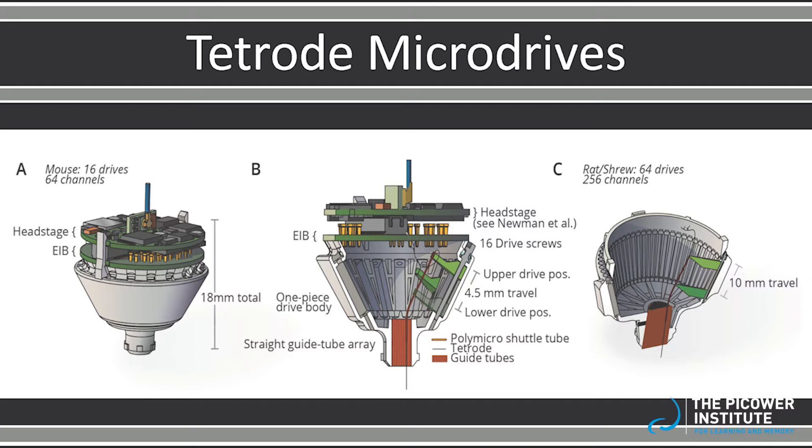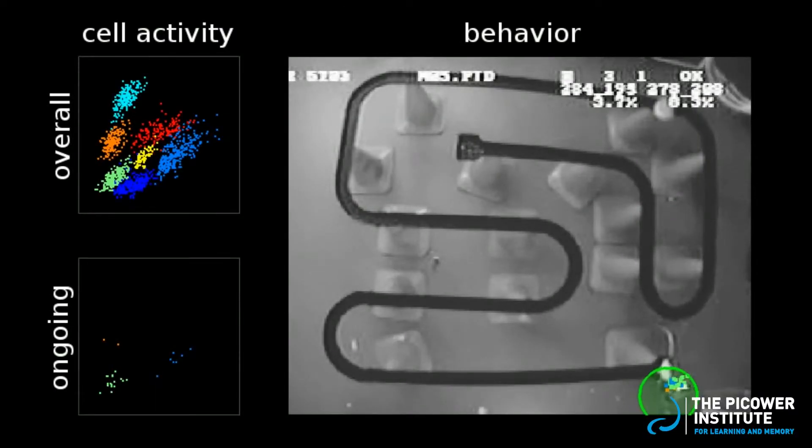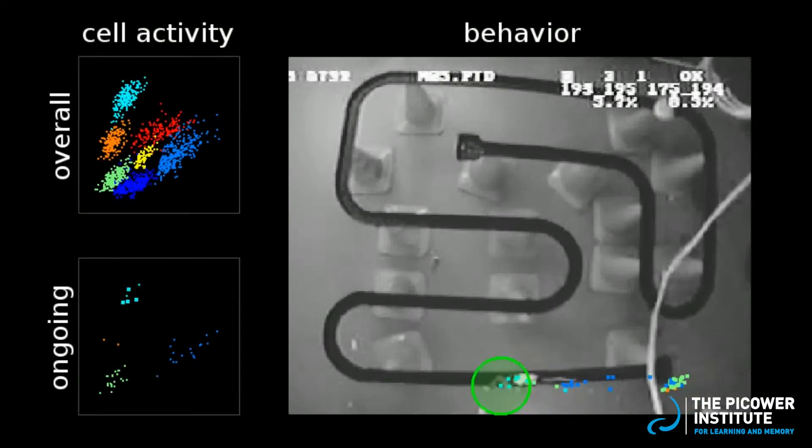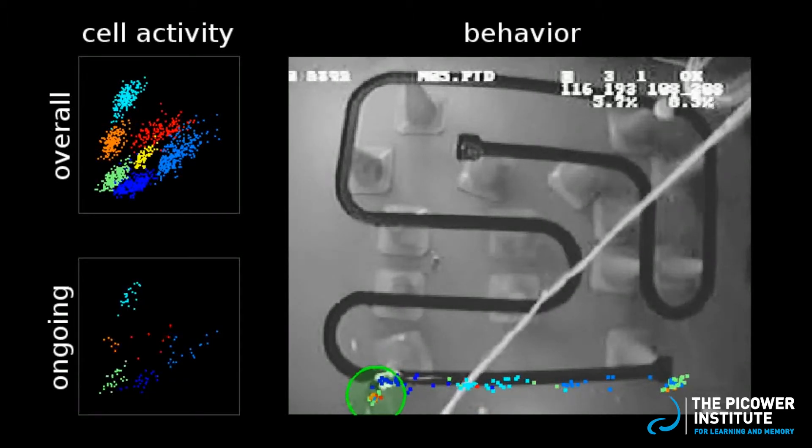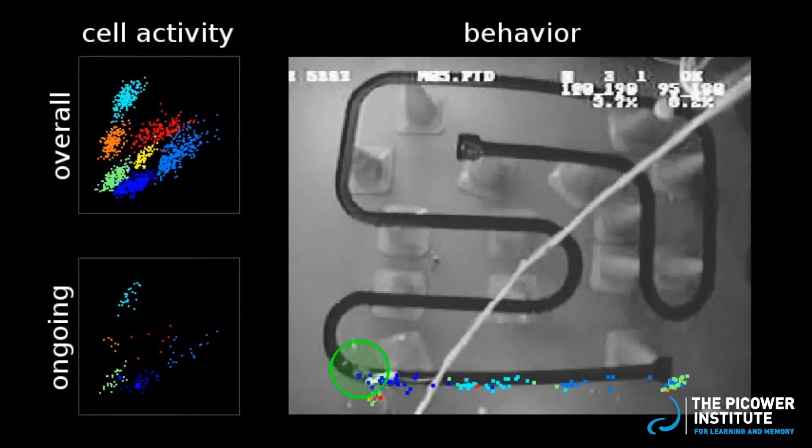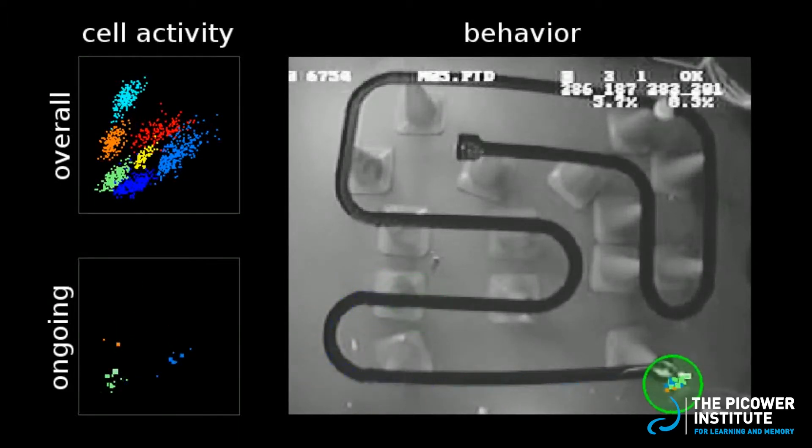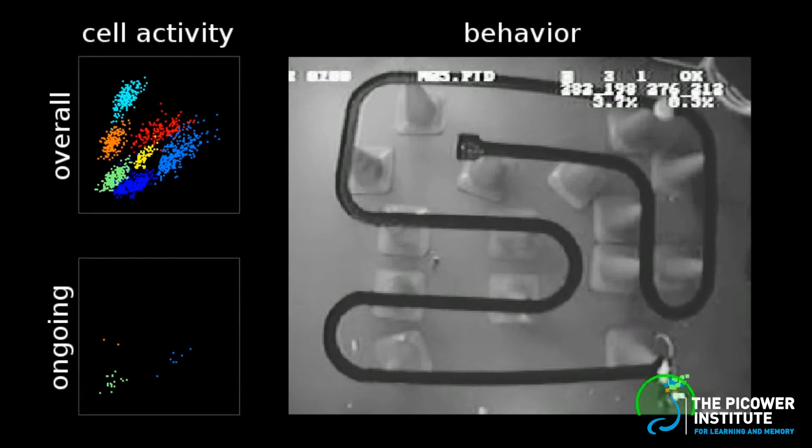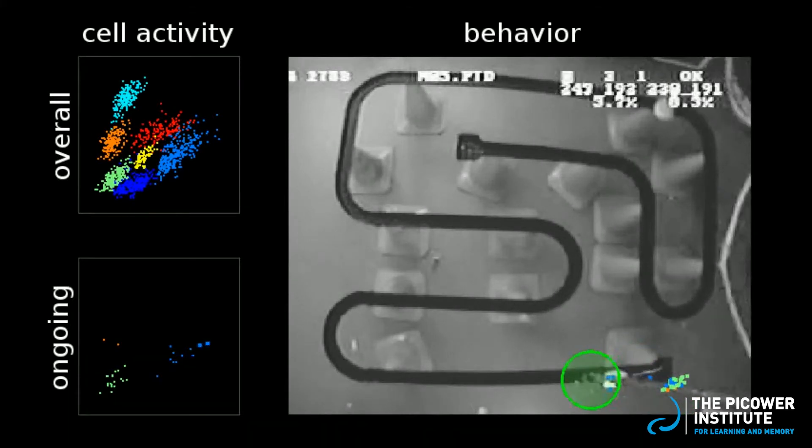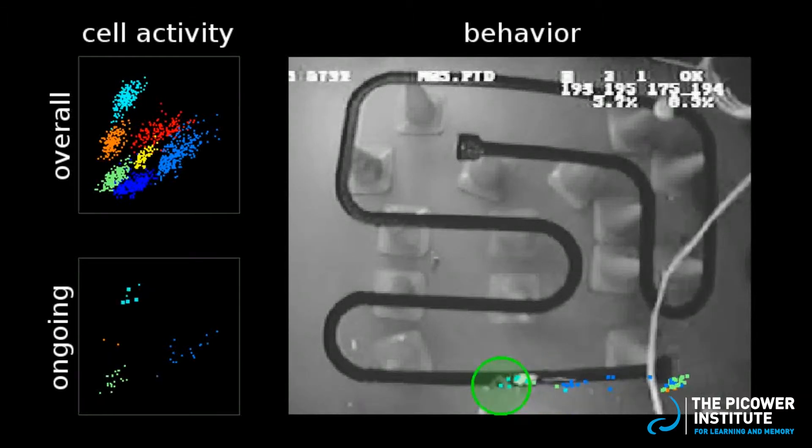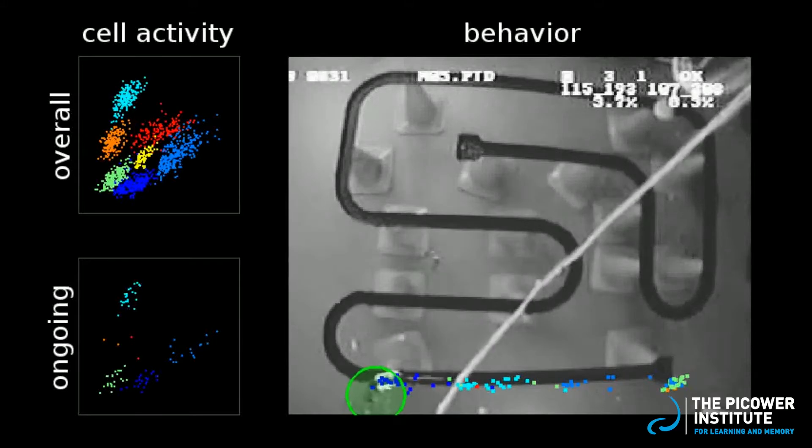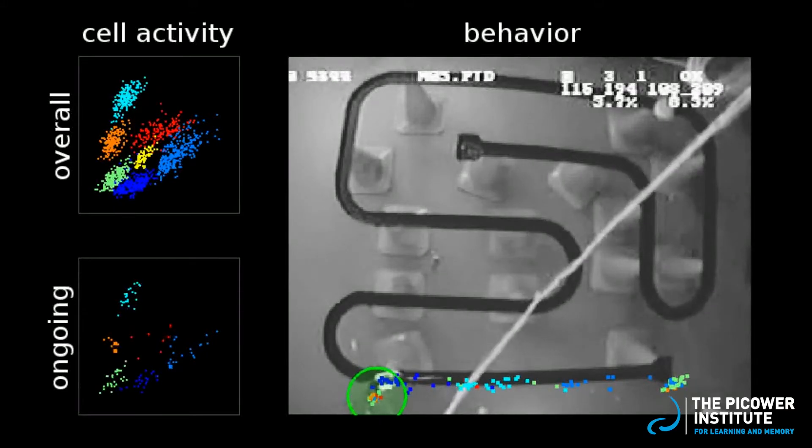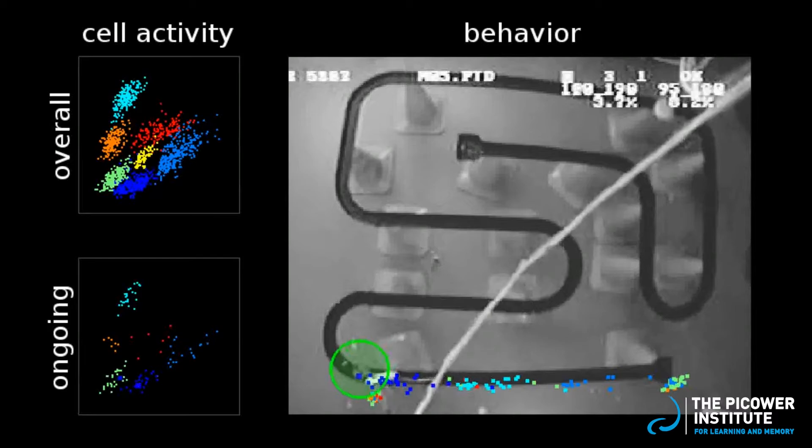In this experiment by former lab members Thomas Davidson and Fabian Kloosterman, hippocampal place cells were recorded as the rat traversed a winding track. In the top left figure, you can see seven color-coded place cells. The individual dots represent each time a place cell fired during one lap on the track. The bottom left figure presents the same information, but in real time as the rat runs along the track. The video shows the rat running on the track. It also shows where he was located as each of the place cells fired. The popping sound is the sound of those place cells firing.